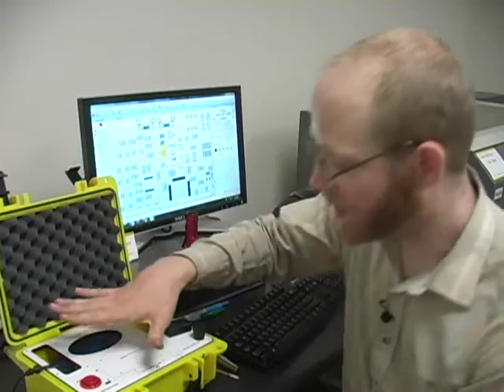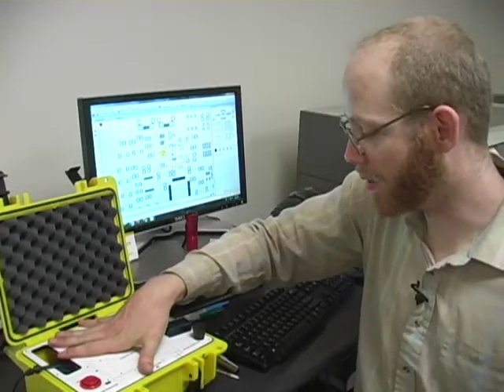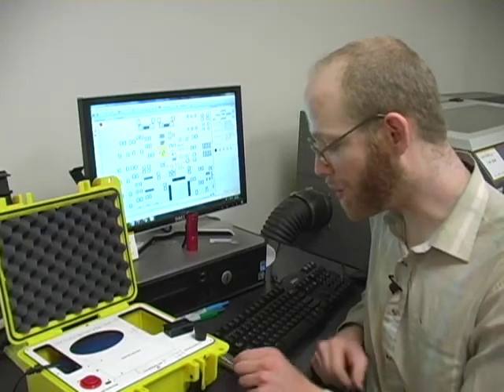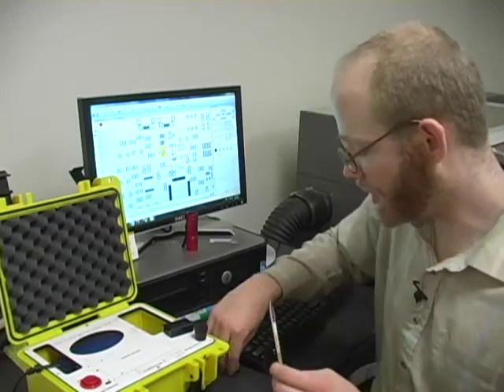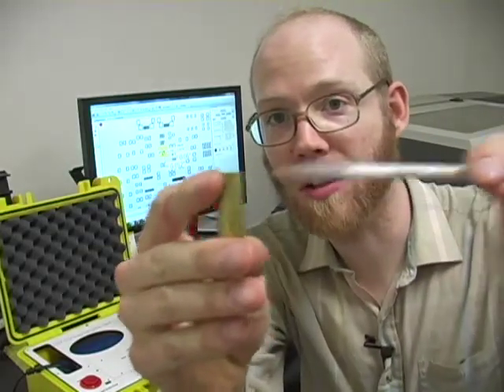I have our DIY formaldehyde testing kit out here and ready to go, and I have to get a tube ready. So I'm going to use this tube breaker I made, stick the tip in and break it over the trash so that I don't get glass anywhere.